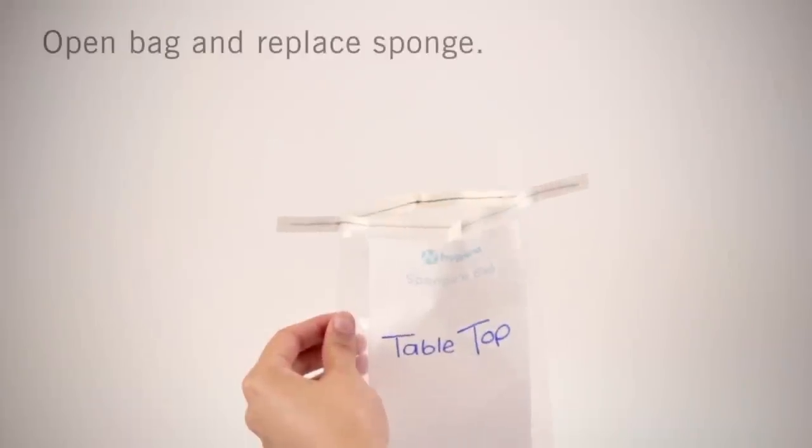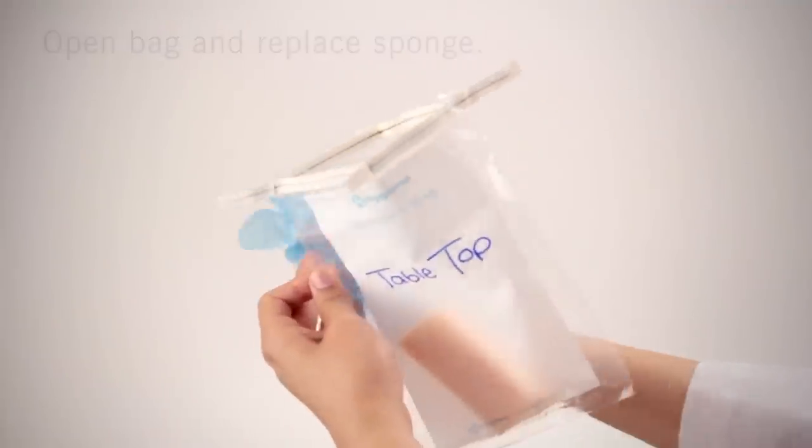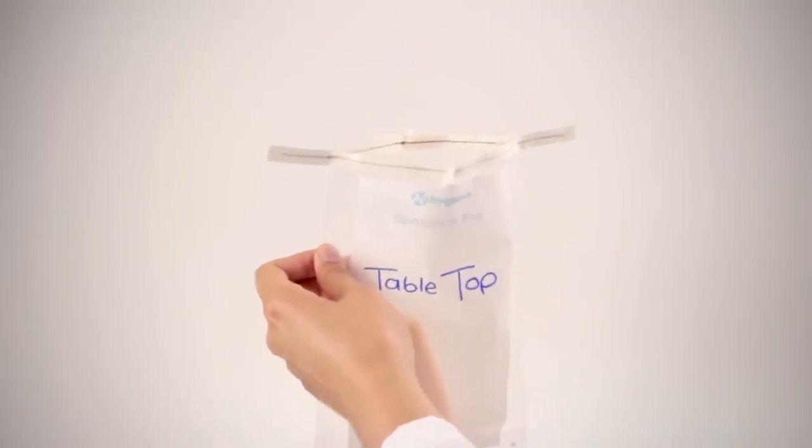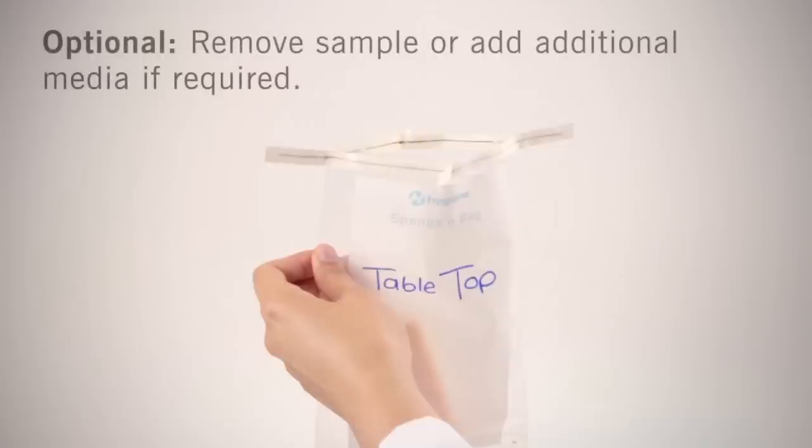Use the center tabs to open the bag and insert the sponge. Aseptically remove and discard your glove. You may now remove a sample or add additional media if required.